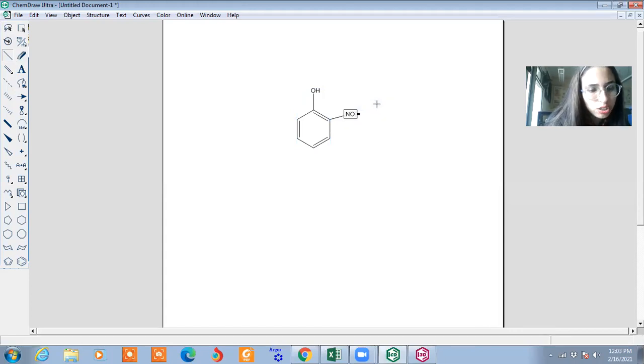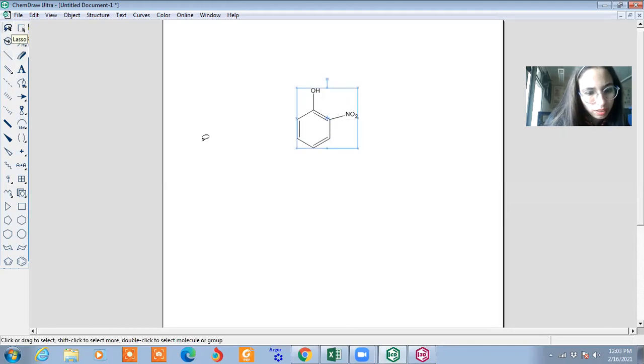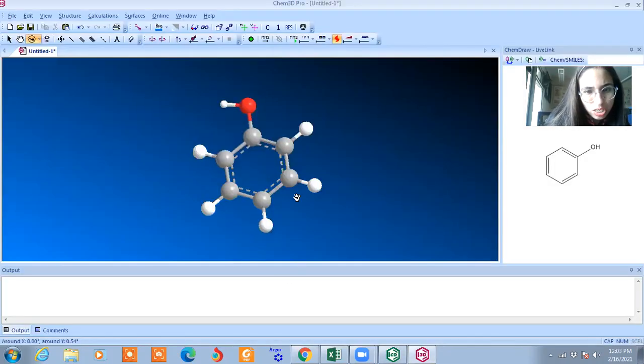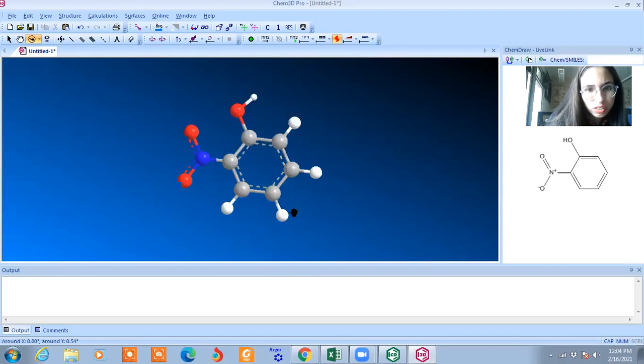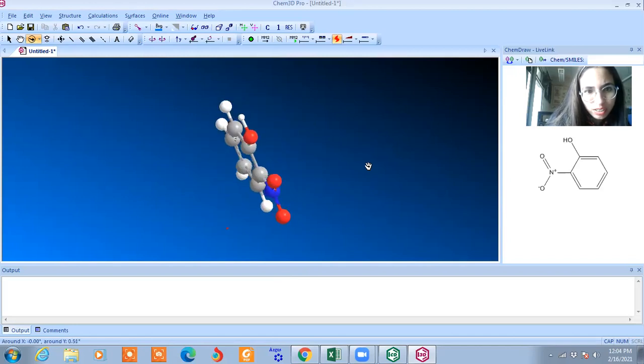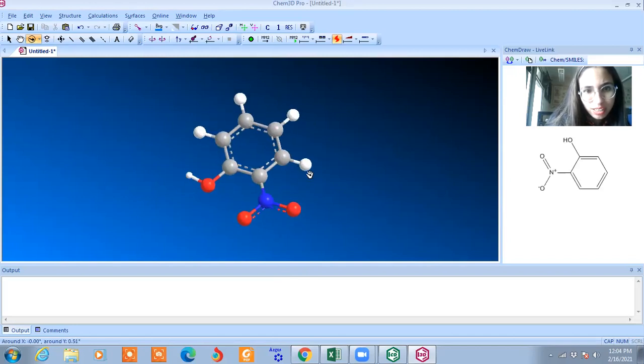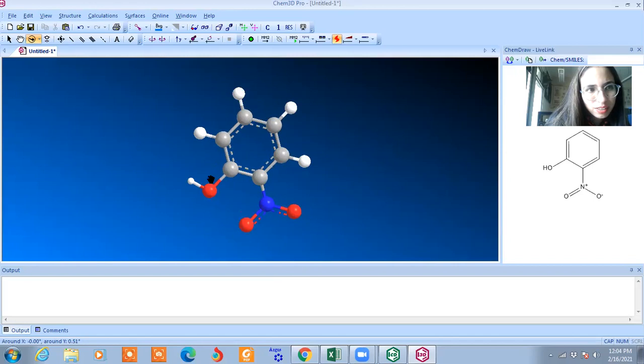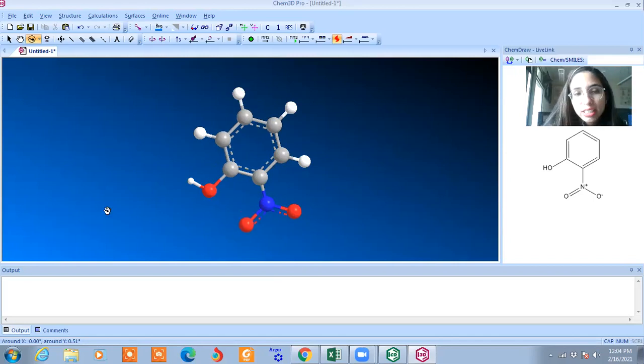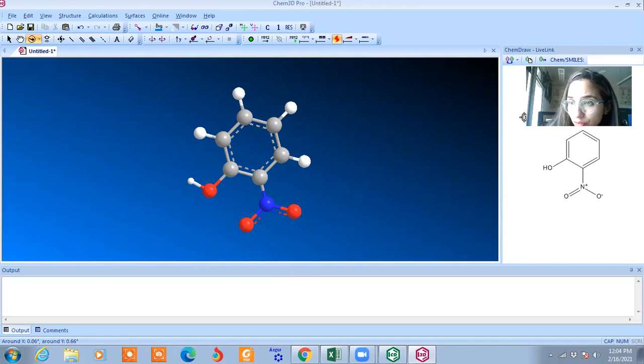I'll draw here nitrile. Just copy the same and paste it on the screen. Now you can see, this is 3D. This is all about 2D. Now you can see, this one is 2D.